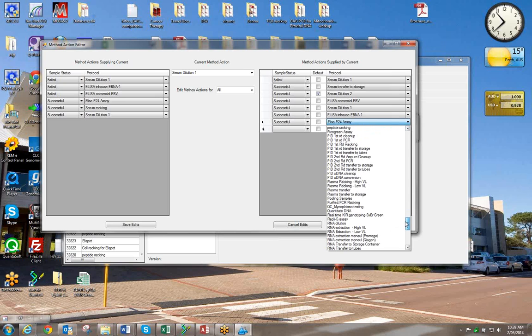Okay? Is it making sense or no? It's making perfect sense, Elab. Yeah, that's great. Yeah, I can add.